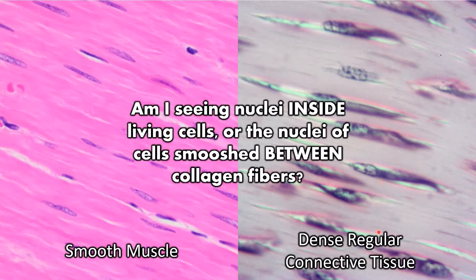I'm going to show you a few examples. I want you to see if you can identify what you're looking at. I'm also going to point out something else that you can look for in case you can't answer this question.